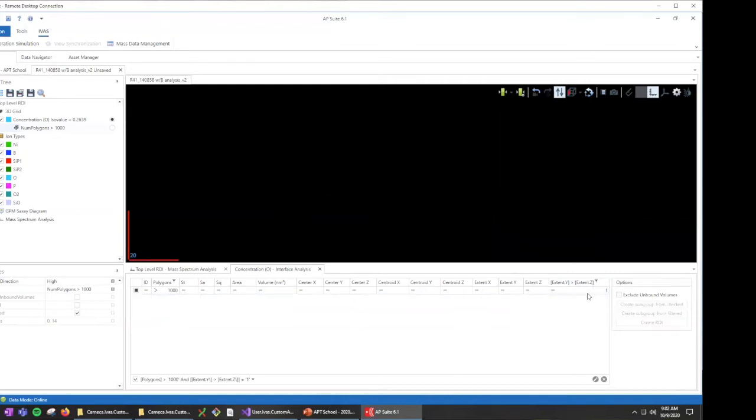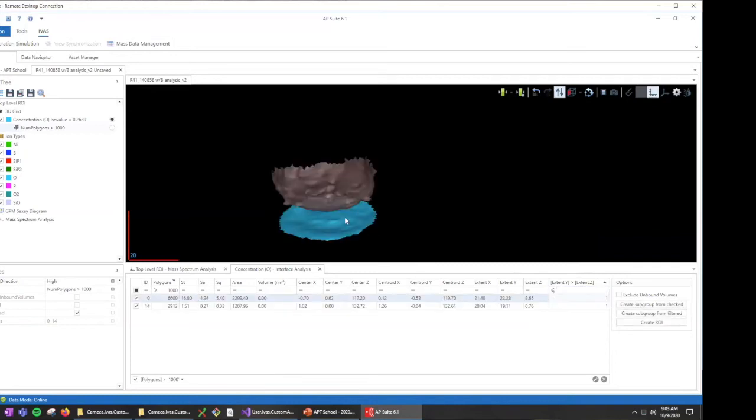This isn't a great example because they're all the same type. I don't know why it's showing that. Not sure why it's not working here. Sorry about that. I can make it such that that formula is now choosing the interfaces, and that also will be saved in the analysis, and you can copy that analysis to a different data set. So you can come up with some creative ways to choose your surfaces in an algorithmic way.